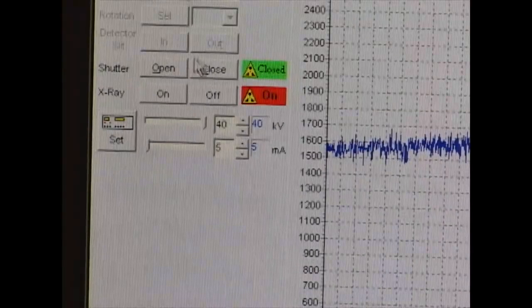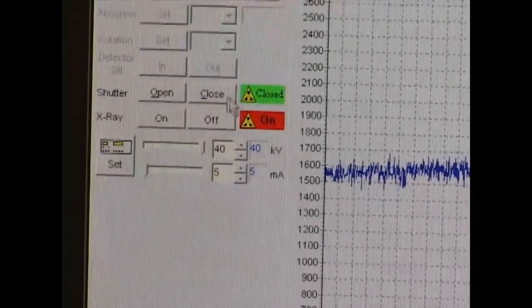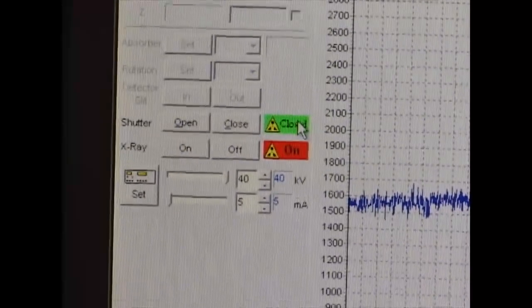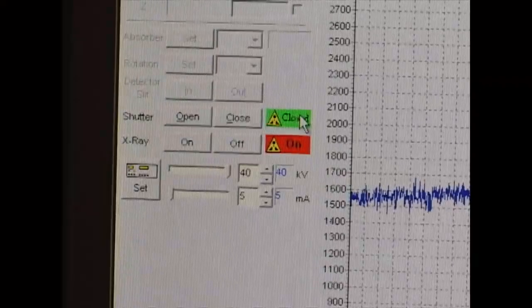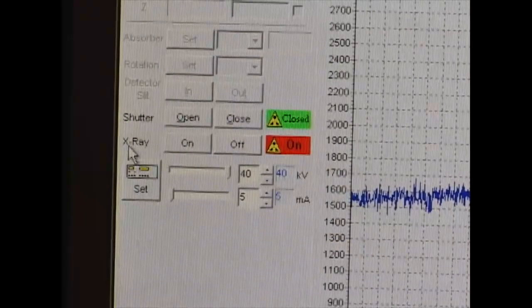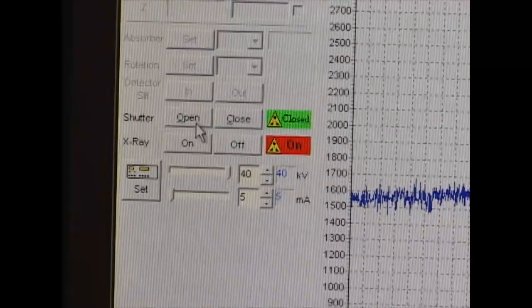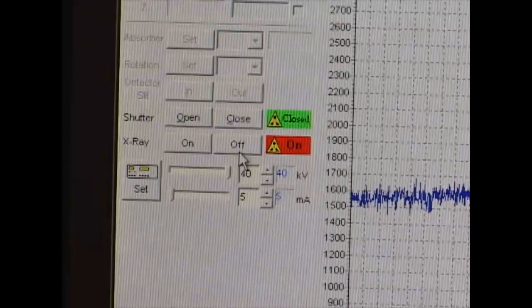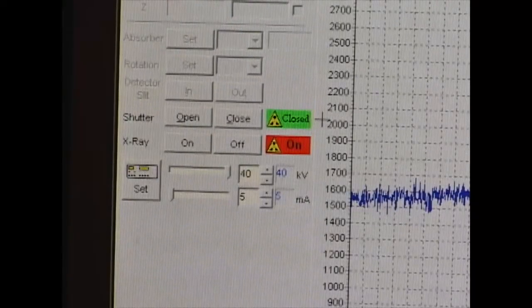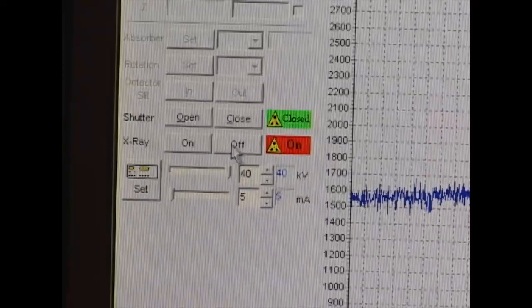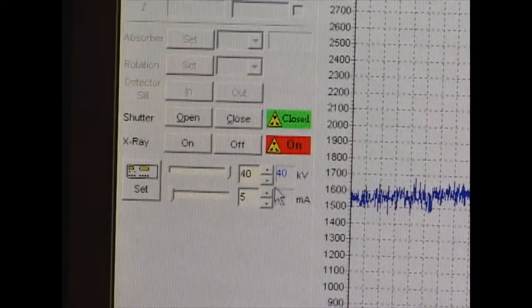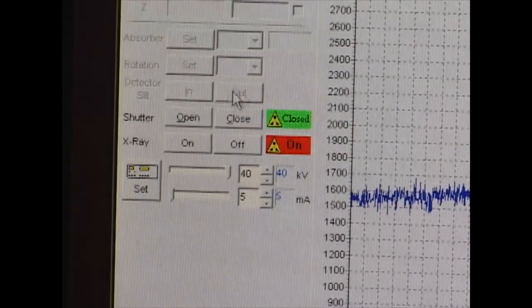Now the other thing to note, it says shutter and x-ray. The shutter is closed and it's green which indicates that you can open and close the door. And the power to the x-ray is on. There are buttons here, open, close, on and off, that you do not want to select. If you start to select these manually, there can be problems with the timing in the computer. It's set up to do this automatically.